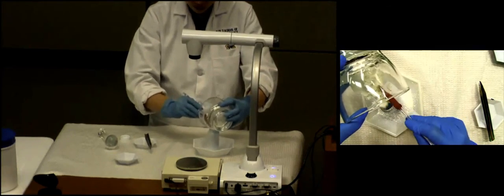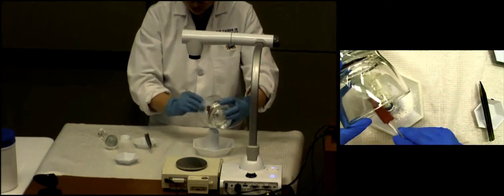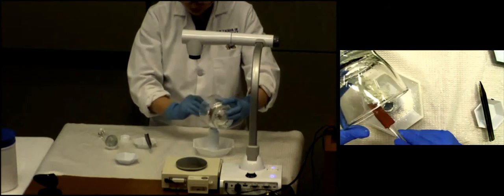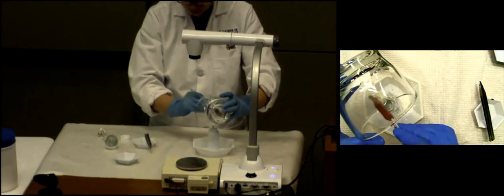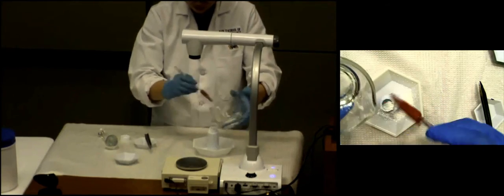Yeah, you can do all sorts of things that you can do that. In this case, we don't have weigh paper for you in general in your drawers. If you're skilled with that and can do it without making a mess, yes, you can. And you don't have to use paper funnels. There are plastic funnels. There's a lot of powder funnels that pharmacists will use to do that. You have to clean it and make sure that you do it between uses. But yes, funnels work well for this.